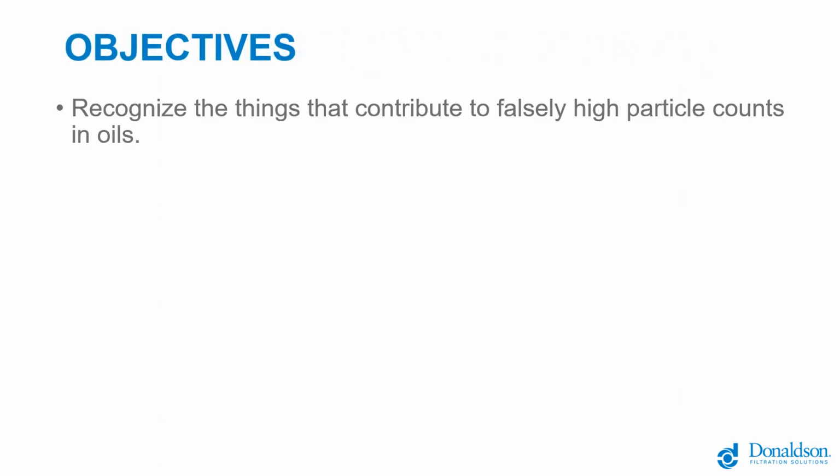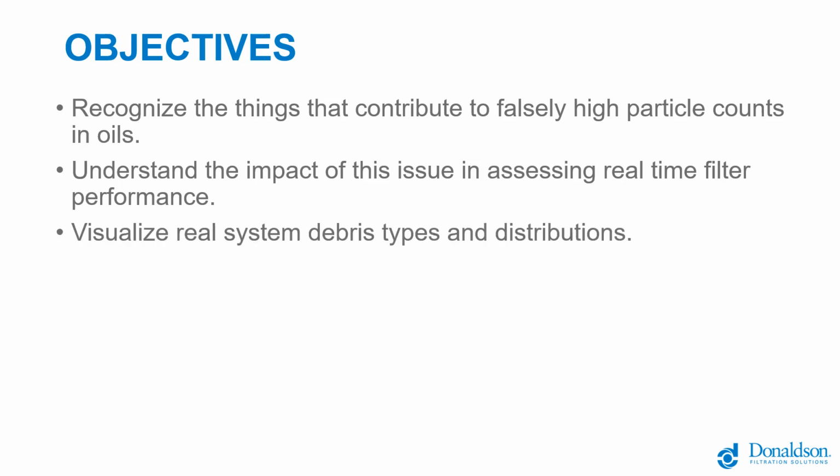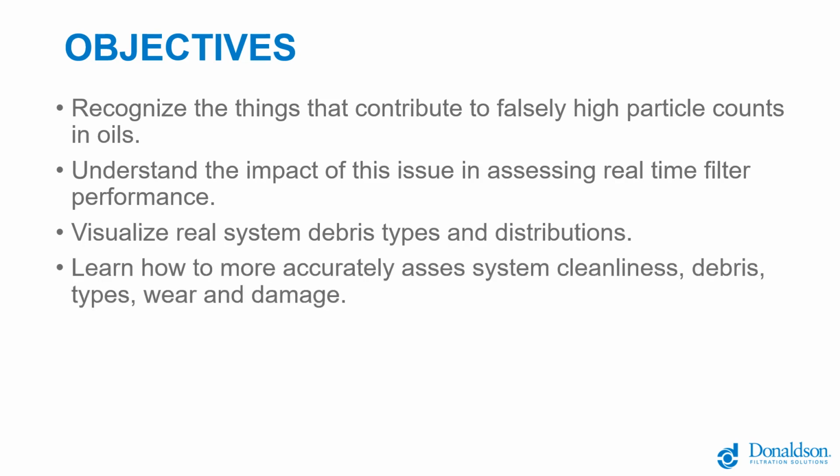So the objectives for today are to recognize the things that contribute to falsely high particle counts in oils, understand the impact of this issue in assessing real-time filter performance, be able to visualize real system debris types and distributions in oils and fluids, and learn how to more accurately assess system cleanliness, debris types, wear, and damage.